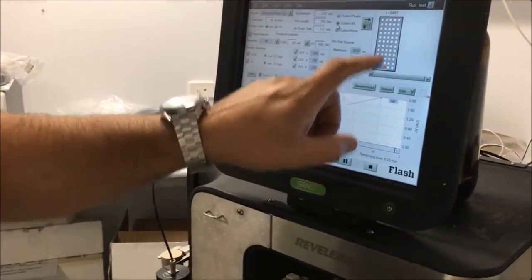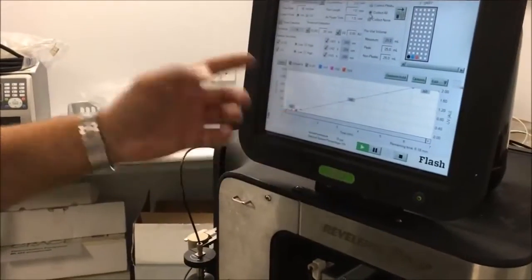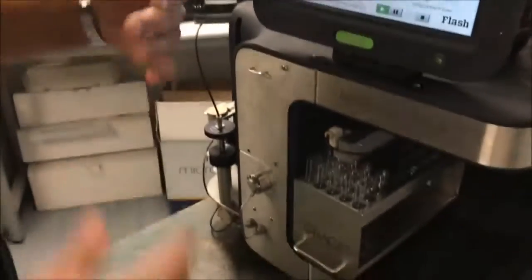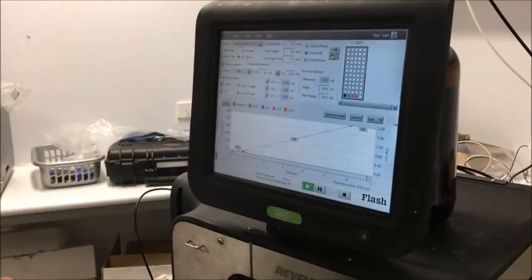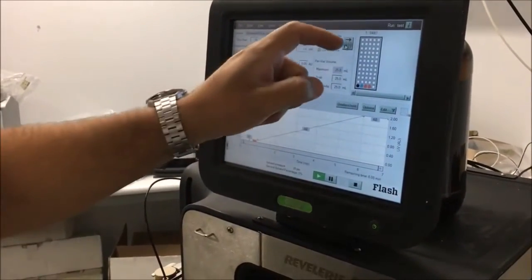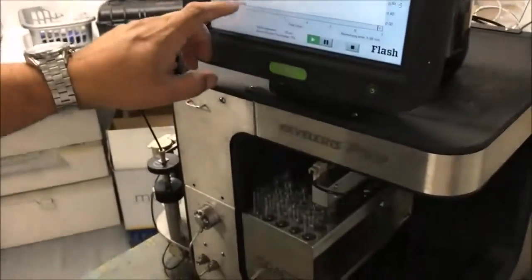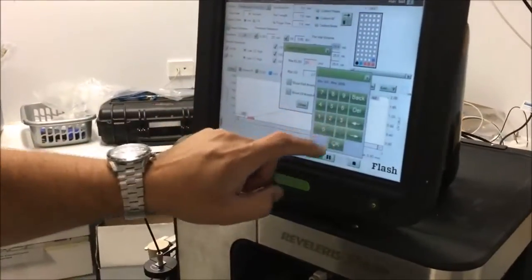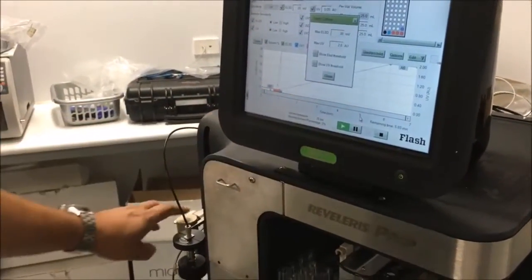You now see a color, the corresponding tube, and you will see a color for the peak, but it's only baseline. If there was a very small peak or something that you're not expecting, you can always go to the next tube. So it goes to the next tube. So now there's a very small peak. Let's look at that peak in closer detail. So that's probably a bit of noise from the old cartridge that I'm using.